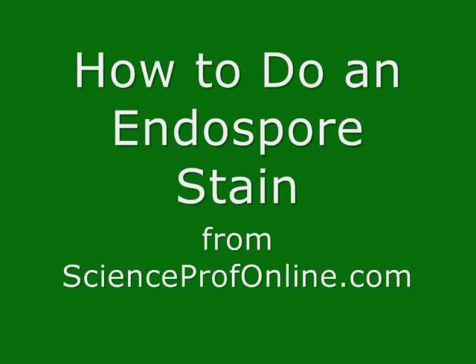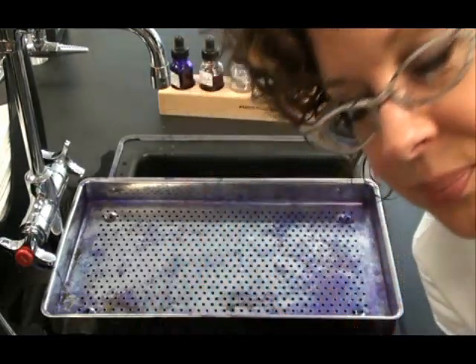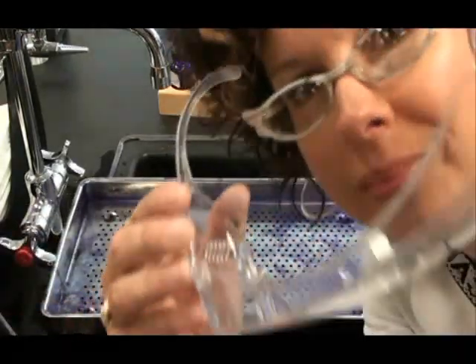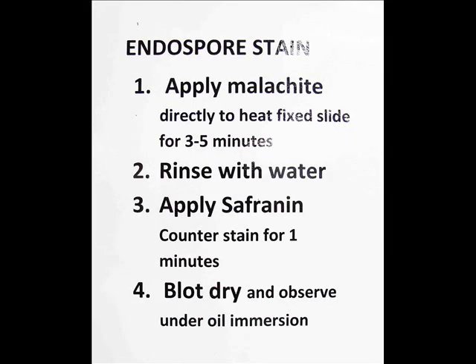In this video I'm going to show you how to do an endospore stain. First we need to put on our eye protection. Here's our endospore staining procedure.